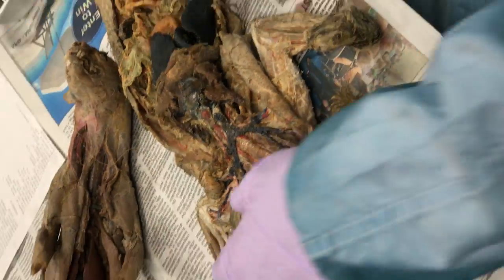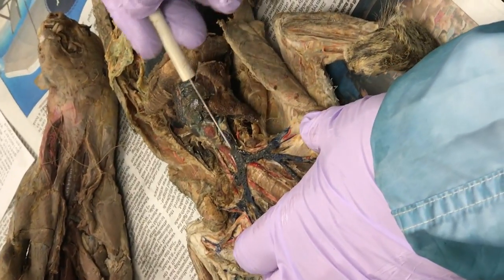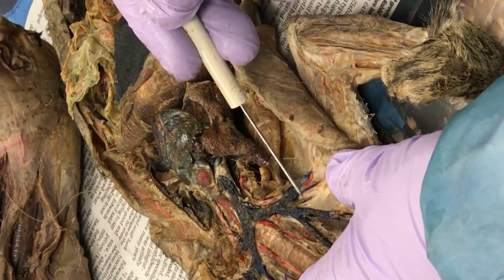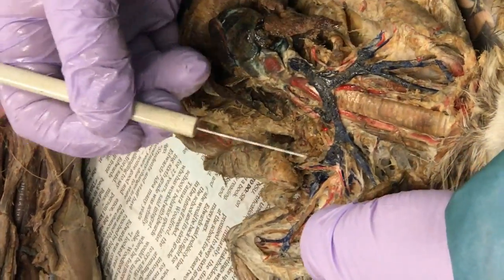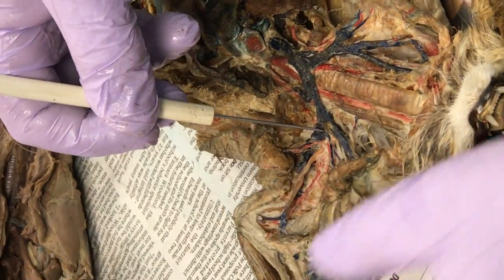Subclavian vein and artery — easy. Subclavian. Here's the innominate — look at the first division there, there's the subclavian right there. Subclavian vein. I'll put a pin right there. Subclavian.